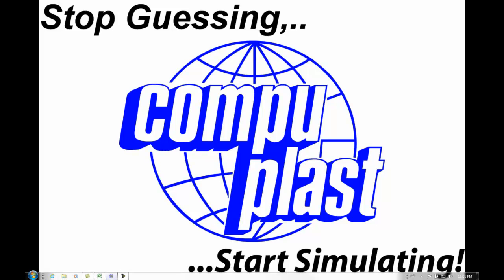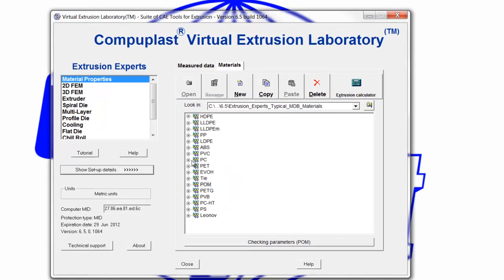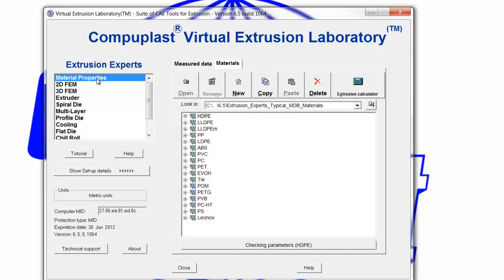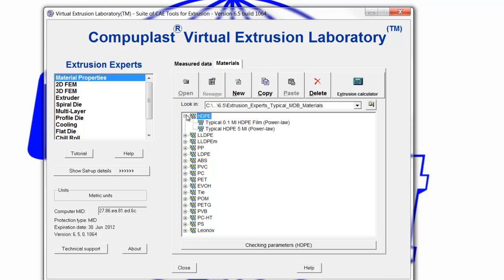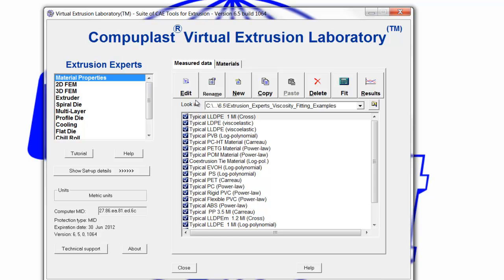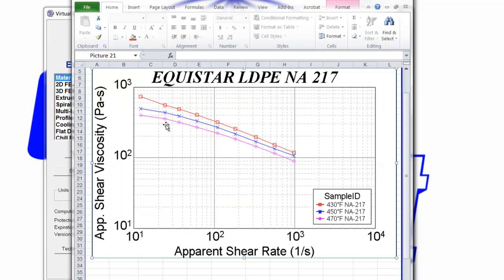Hello. Today we will continue with the CompuPlast Virtual Extrusion Laboratory Material Properties Module, and we will see how to prepare a material data file based on measured viscosity versus shear rate data. The following Excel spreadsheet shows a graph of a LDPE NA-217 material showing the apparent viscosity versus the apparent shear rate at three different temperatures: 430, 450, and 470 degrees Fahrenheit. This is the type of data that we need to prepare a material file.